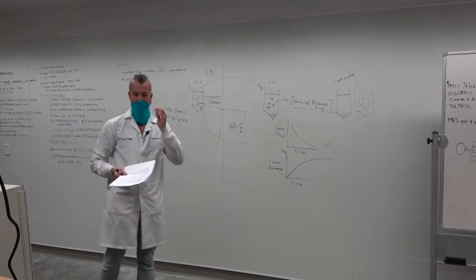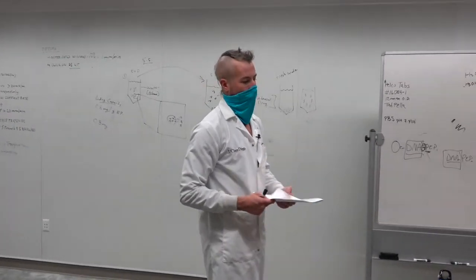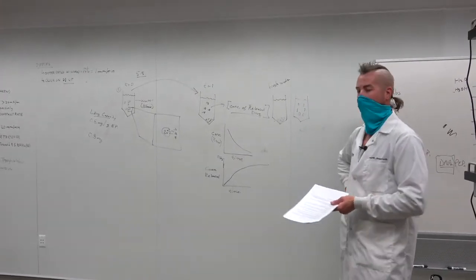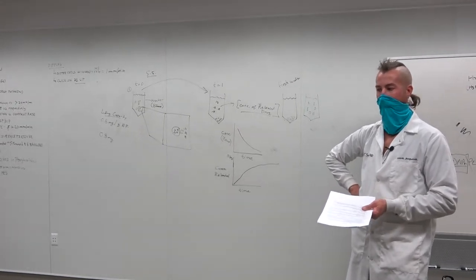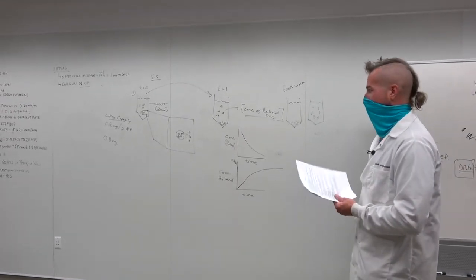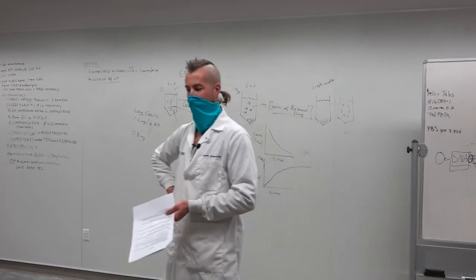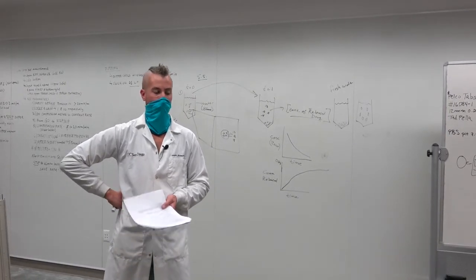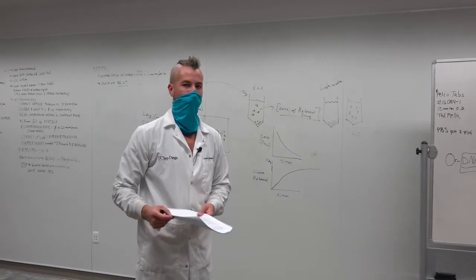This one, there's actually a fair amount of math. It's simple mathematics, but you kind of have to really pay attention to what you're doing, how much volumes you're using. Okay? So go back and watch this again if it's not clear. You can also watch my video on Canvas again, and then we're going to transition, and I'm going to show you some of the lab techniques that you would have used had you been in lab.